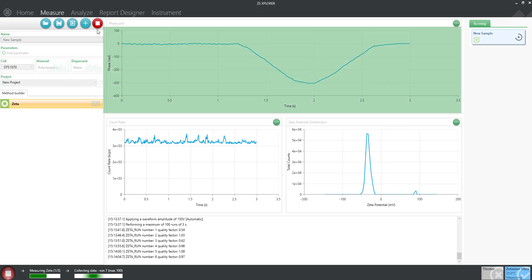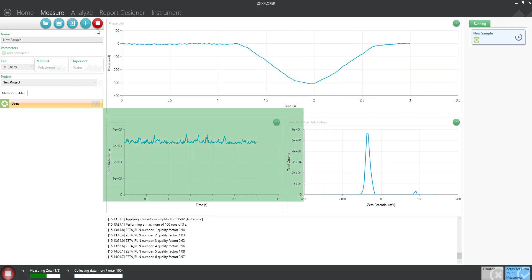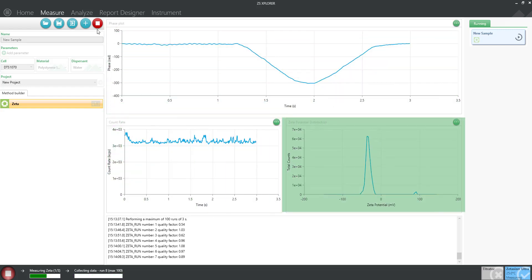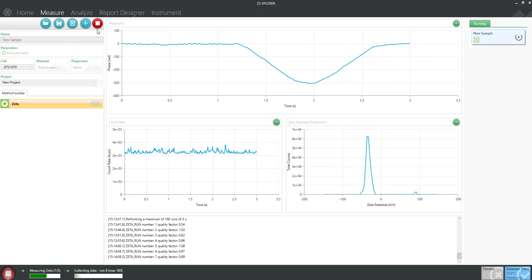You can view real-time data such as the phase plot, count rate, and zeta potential distribution if applicable. In just a few short minutes, you will hear the audible tone that alerts you the measurement is complete.